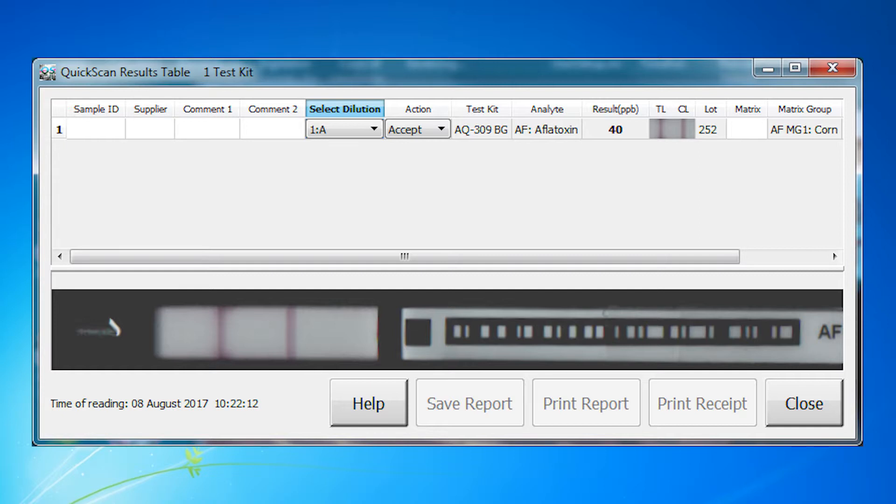Adjusted results are valid in the range of 30 to 100 parts per billion. If your sample results from dilution A testing are greater than 100 parts per billion and you desire additional quantitation, you may run the dilution B protocol.